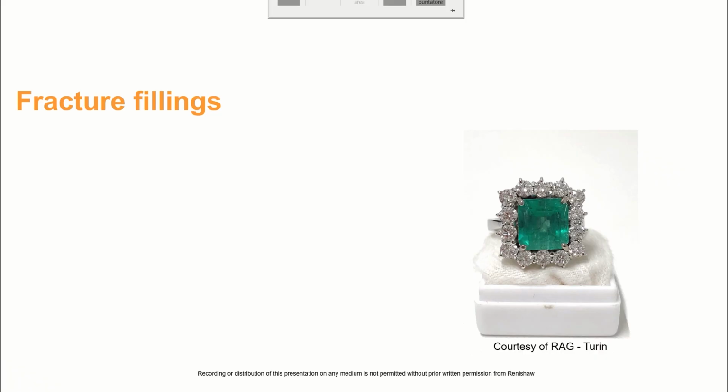Another very important topic for the gemmologist is the identification of the fillers in fracture treatments. Fillers used to hide cracks can normally be of natural or artificial nature, and Raman is particularly adequate to study this because of its very high spatial resolution.